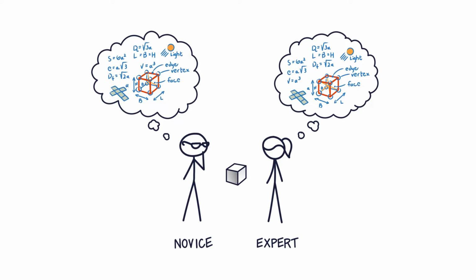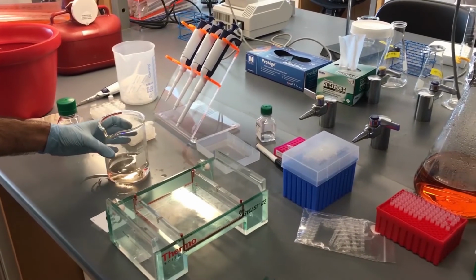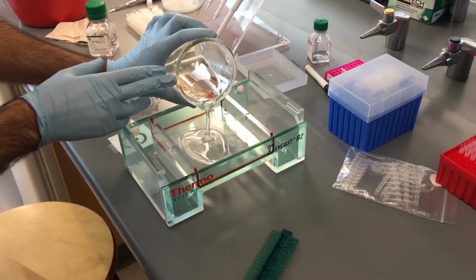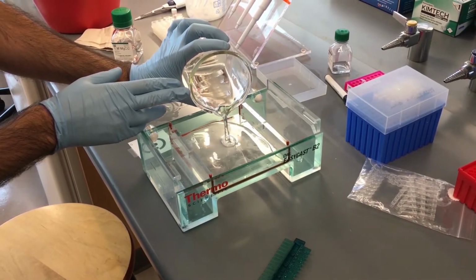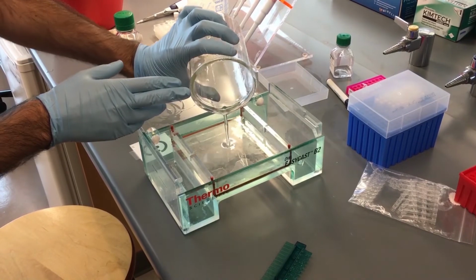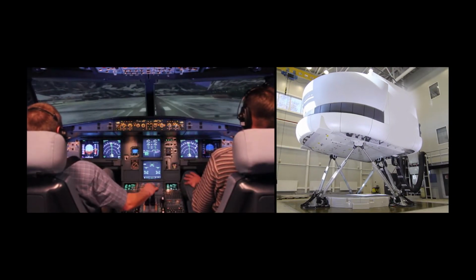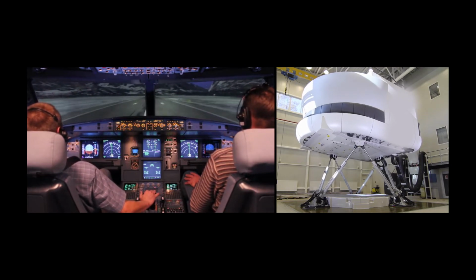Well, building good mental models requires a lot of effort. In the case of gels, researchers usually need to take a lot of time to practice just learning the precise recipes for how to make them, let alone interpreting the data. A complementary approach is to use interactive media and simulation to guide the learning process.